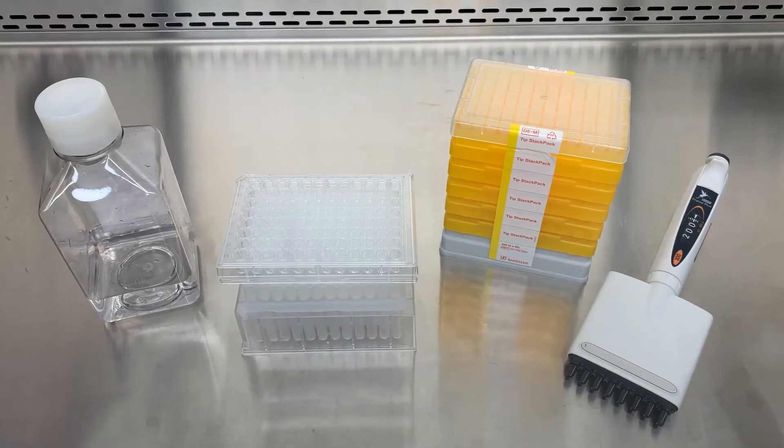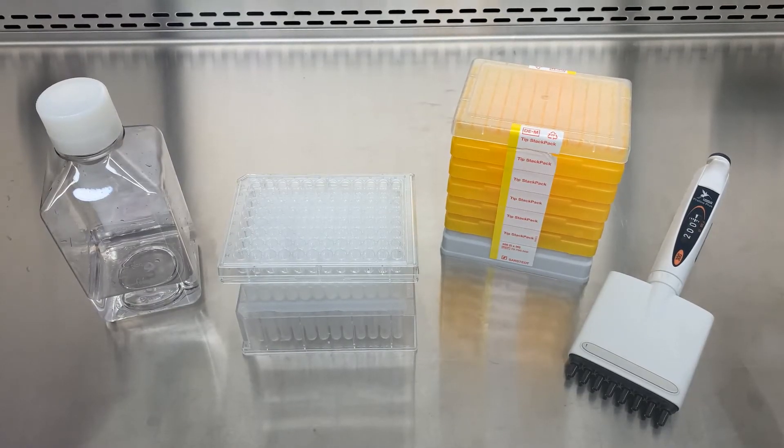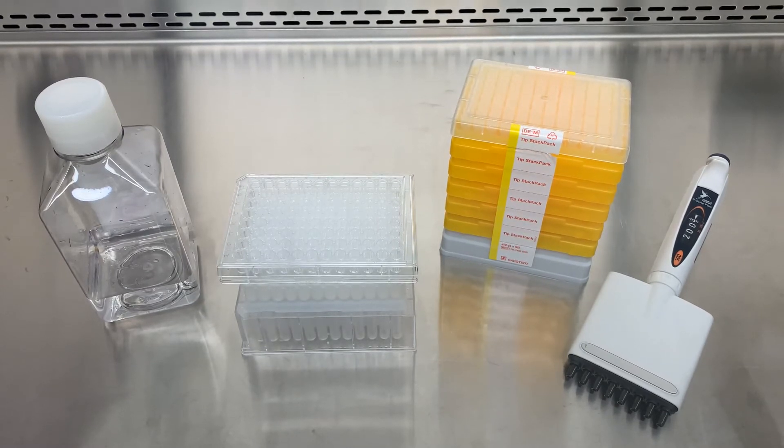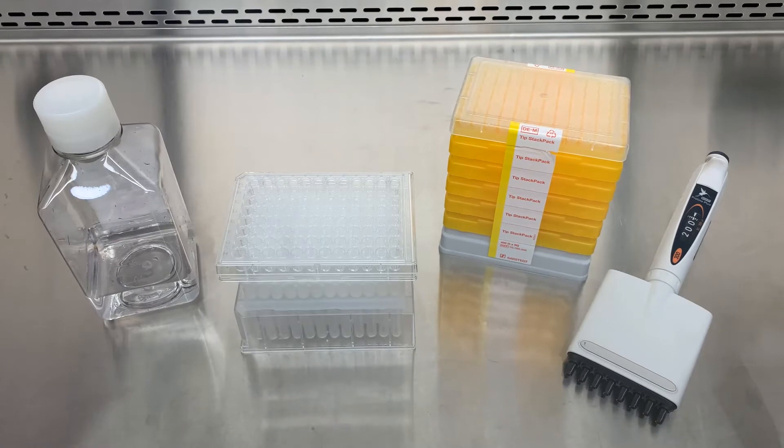In addition to the materials provided, phosphate buffered saline and a multi-channel pipette that can be used at a volume of up to 250 microlitres are required.